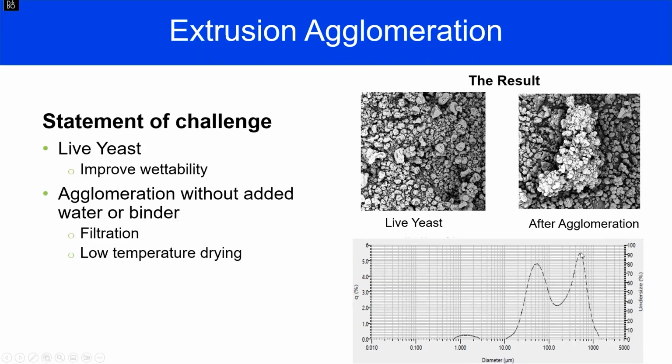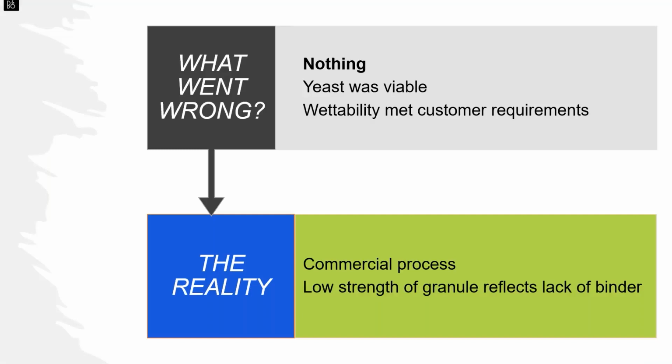This is the granule. So the question is, did we only agglomerate some of it, or during the drying process, where it was fluidizing, did it break up? I would say we had nice viable yeast when this was all done, because we dried it at low temperature, but that meant a long time in our fluid bed dryer.